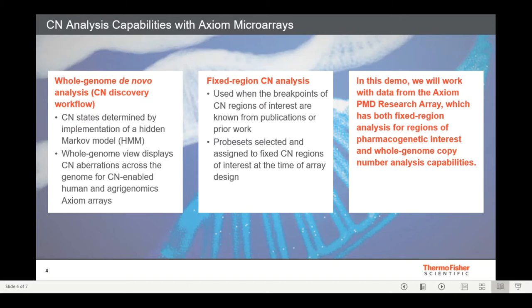There are two main methods of copy number analysis used with Axiom Microarrays. The first is a whole genome de novo analysis, which we refer to as the copy number discovery workflow in Axiom Analysis Suite. With this method, the hidden Markov model is used to determine copy number states. This provides whole genome copy number information, and our software provides a visual tool to display copy number aberrations. This method is available for many human and agrogenomics Axiom Array types.